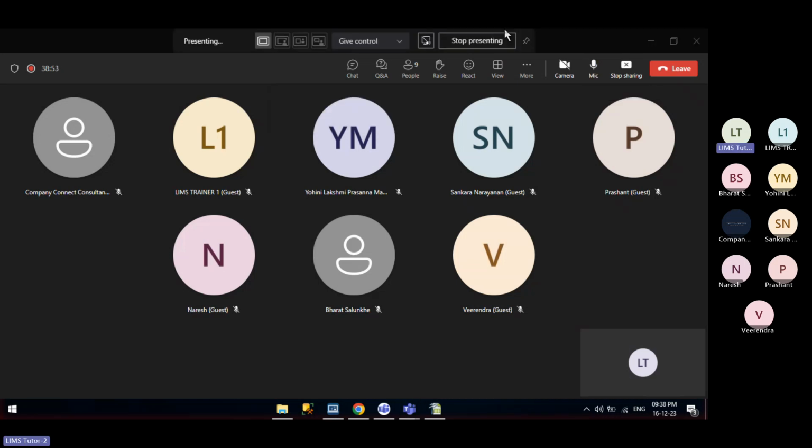Sorry for that. We will show you how a basic report is designed in Crystal Report, and then how, once the report is designed, it is configured in LabWare LIMS. We use only two modules or two tables to connect an already designed Crystal report with LabWare LIMS, and we will show how you can preview and print the report in LIMS.